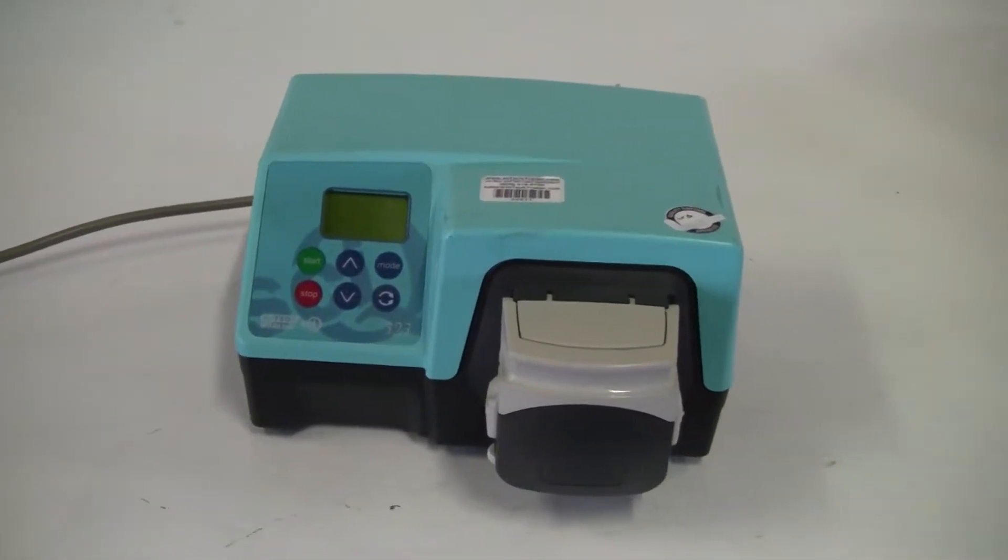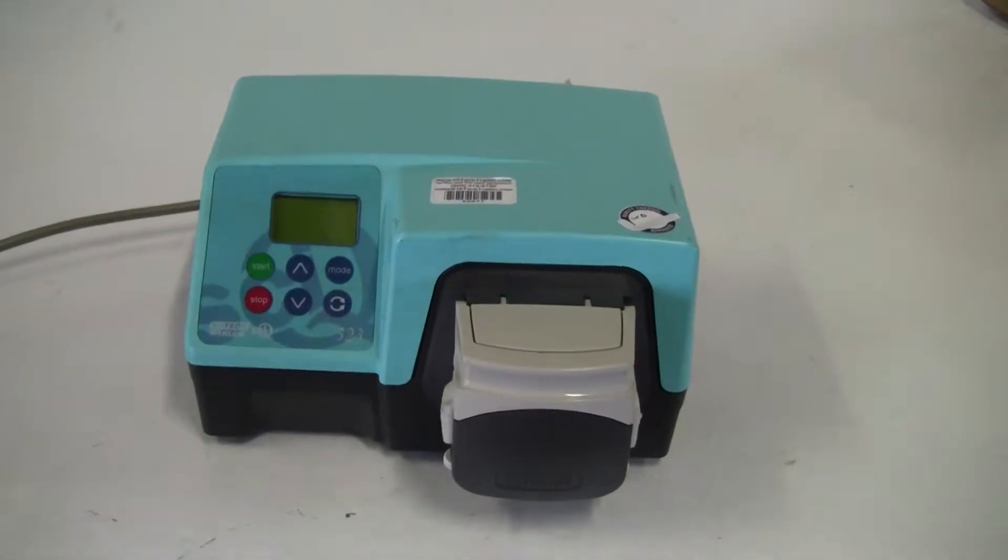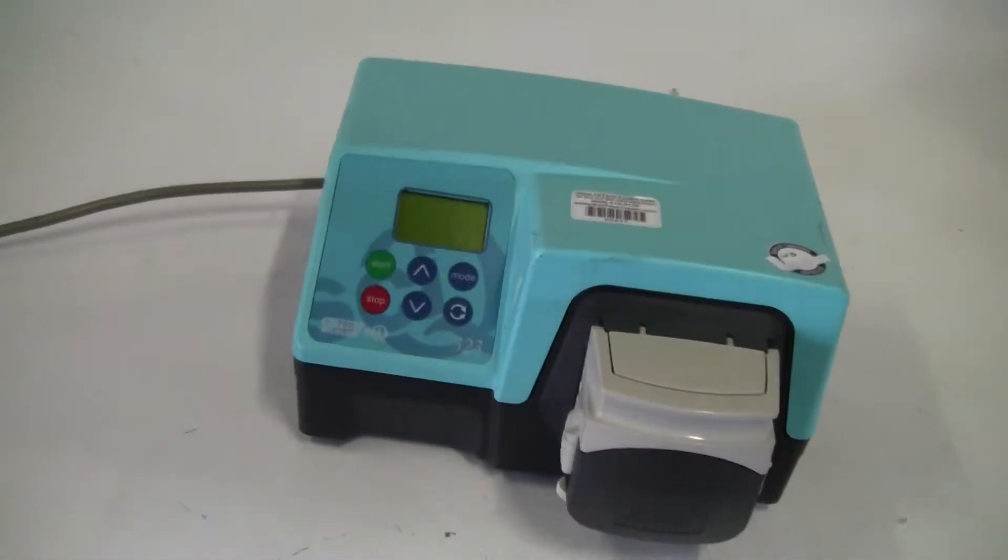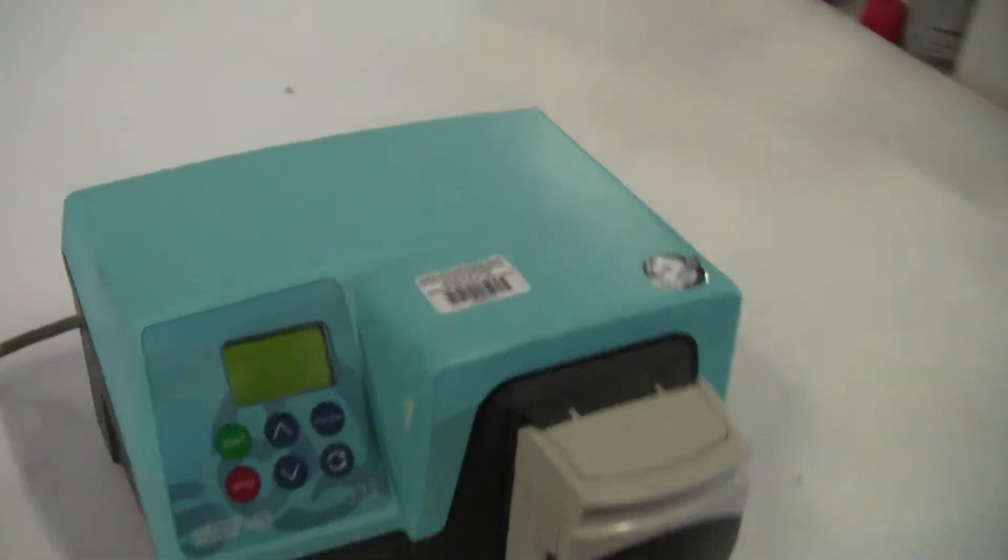Hi, this is Jim from HitekTrader. We're looking at the Marlow Watson model 323 peristaltic pump. The pump has flow rates from 0.45 to 2,000 milliliters per minute.